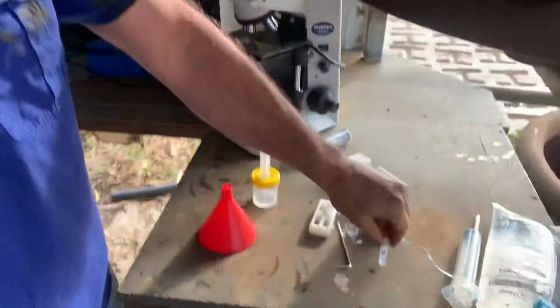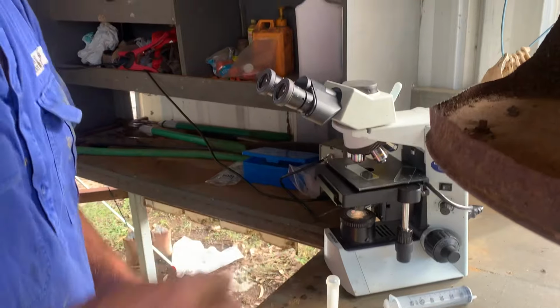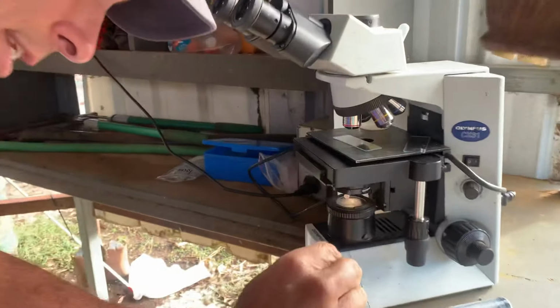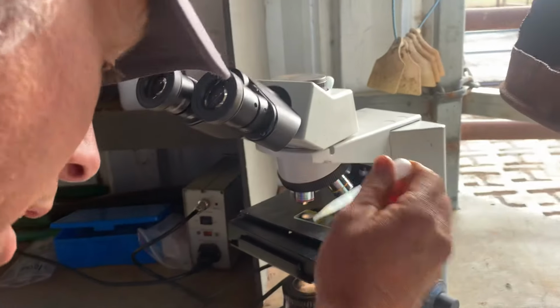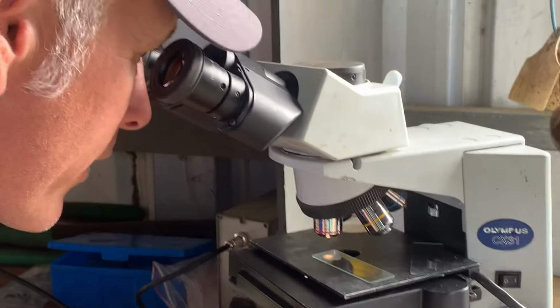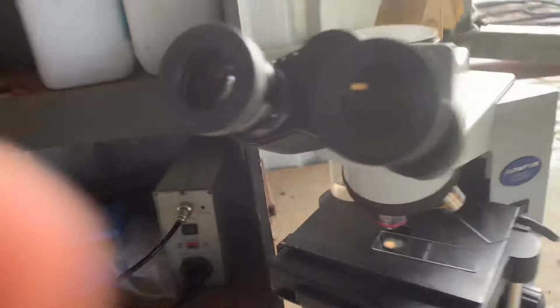Come over here. Got our microscope set up. We've got a tube here for doing the morphology already set up. Put that into here, and I'm going to take a little drop of this. We've got a slide sitting on this heated stage, so the stage is all warmed up. We want to keep these little guys dancing. Put that on there. Look down the microscope, and you can see the mass activity is rip roaring. So he's going to be a winner.